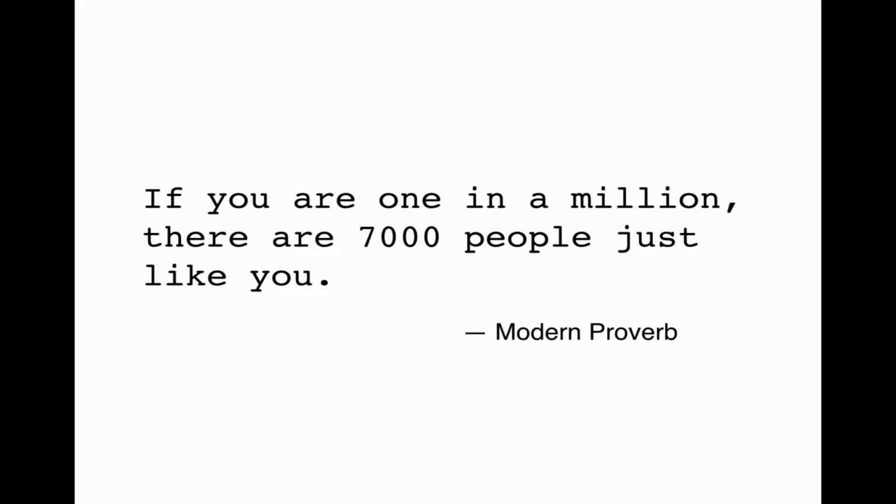So this actually leads to some problems with the p-value as a statistic, because something that looks very improbable on the level of an individual estimation, say a p-value of 0.05, all of a sudden can become quite probable when you regard multiple statistics or multiple different tests at the same time. When we look over an average of 20 different measurements, all of a sudden you would almost expect there to be something that's as unlikely as just 5% of the cases.